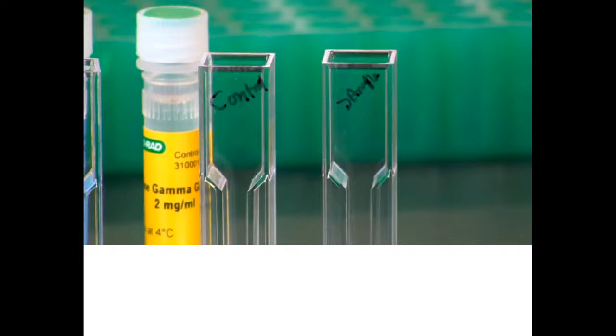Pipette 20 microliters of diluted milk sample into the cuvette labeled sample, and 20 microliters of 1x PBS into the cuvette labeled control.